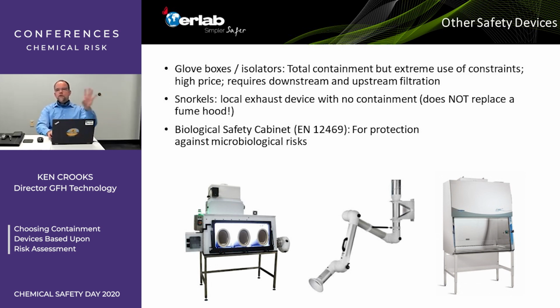There are ductless versions, there are ducted versions. There are some that can use small amounts of chemicals, but here again, they do not replace chemical fume hoods. So if you need to do chemical manipulation, you would do that in a chemical fume hood, not a biosafety cabinet. If you need to work with biologicals, you would do that in a biosafety cabinet, not a chemical fume hood. And don't forget that the biosafety cabinets do provide protection of the product. So the product will not be contaminated by the user or any contaminants in the air inside that laboratory. It's a HEPA filtered downflow inside of that enclosure.